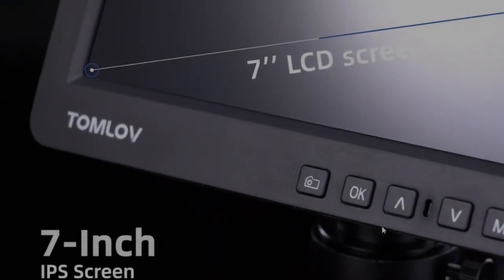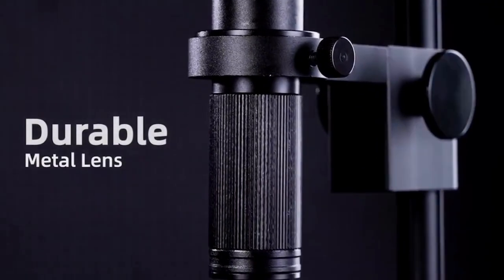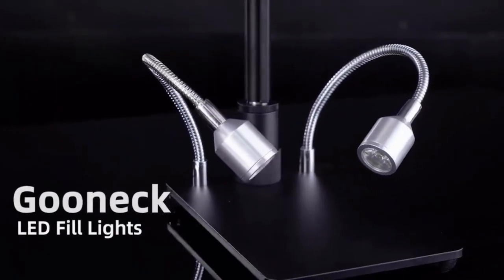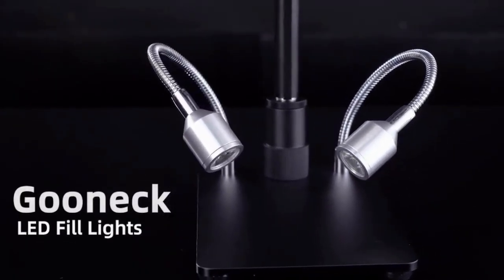Founded in 2011, Tomlov has been all about pushing the boundaries of wellness, power and innovation in the realm of microscopes. Let's dive into the details and see what makes the DM209 stand out.